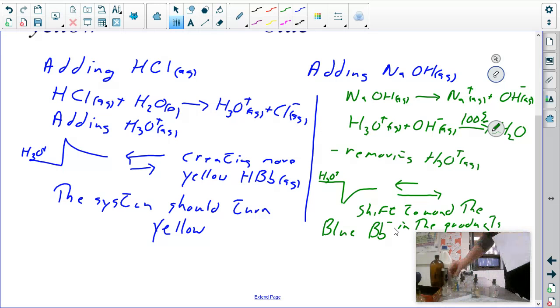But I'm breaking this down according to what's happening. Le Chatelier's principle states the system's going to fight you. That's at your very, very basic. If you can then start to talk about the forward and reverse reactions, which I find very, very useful, that's the next step for this.